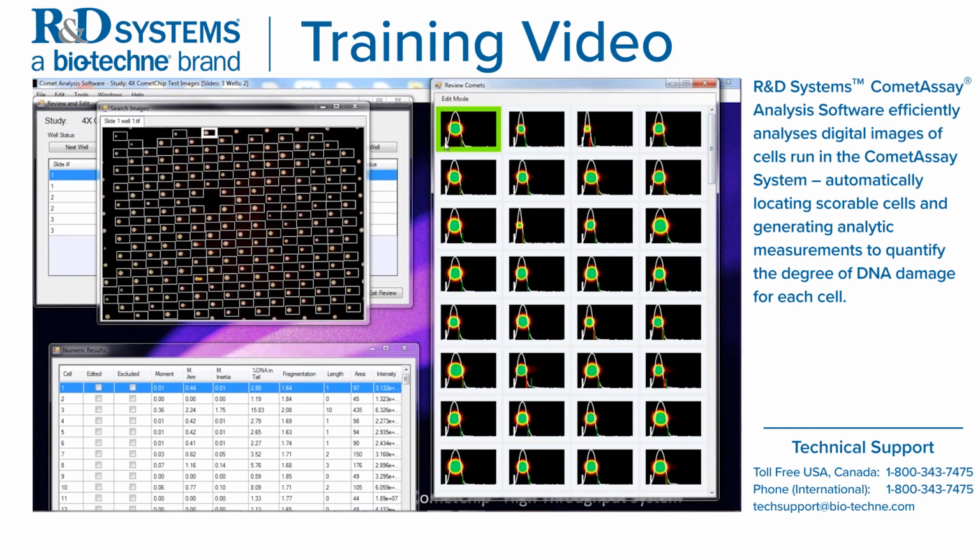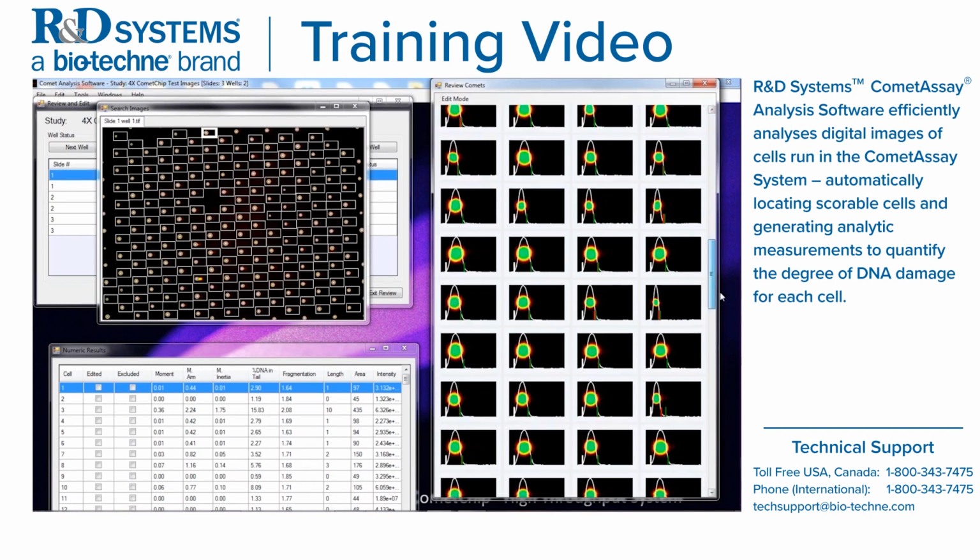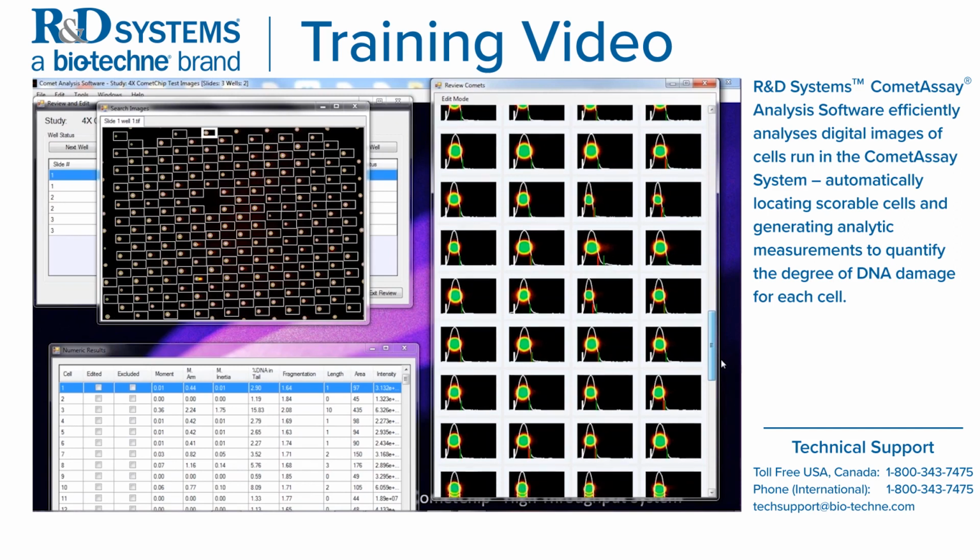You have head markers. The white places the marker at the start, the red at the end of the head, or beginning of the tail, and the green is at the end of the tail. So you can go through here and look at where these markers are actually positioned.